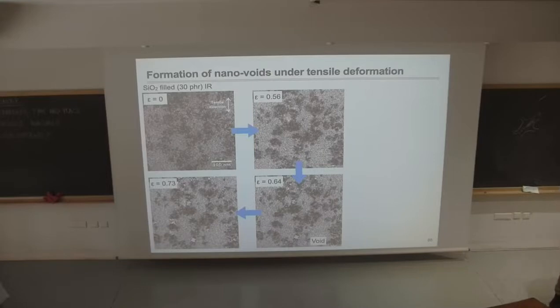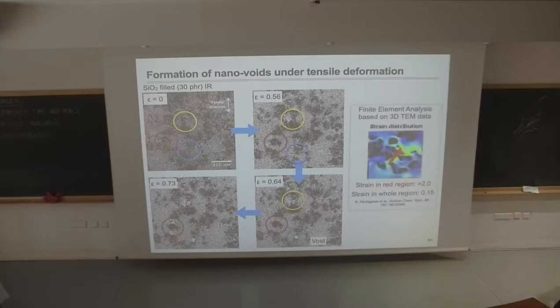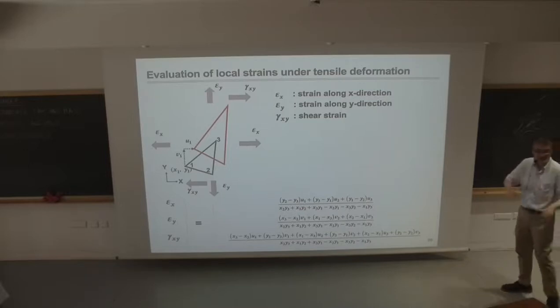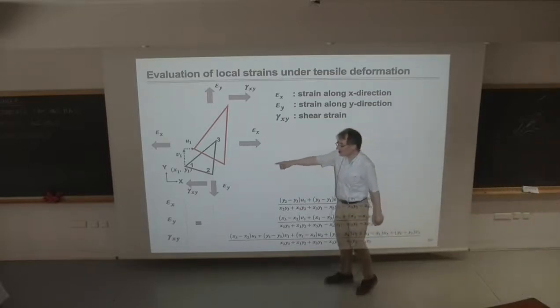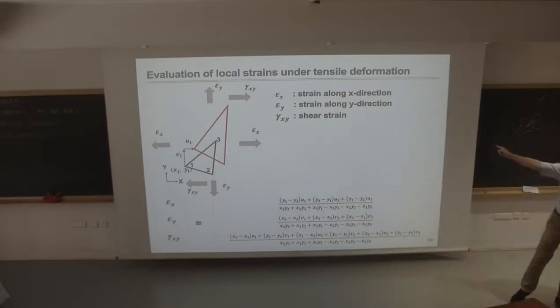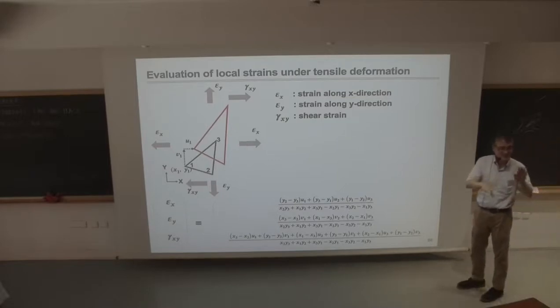Yeah, please. This is strain, right? Like the change in length over initial length. Change in length over initial length, for example. Yeah. So from this data, what we can do is measure, and I sometimes confuse stress and strain. Okay, we can actually try to measure the local strain. Sorry, strain. I sometimes mix up strain and stress.